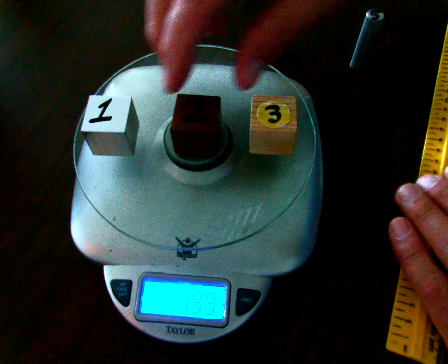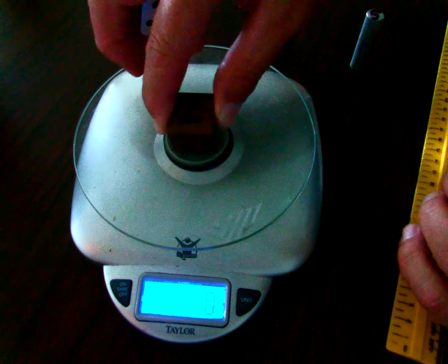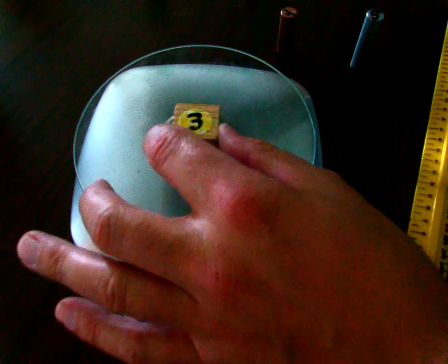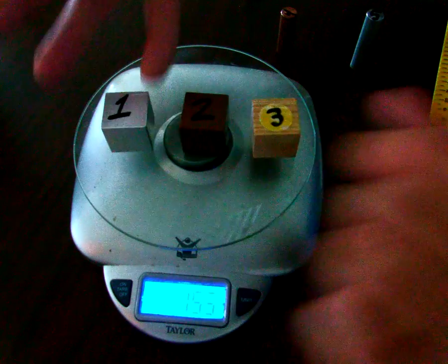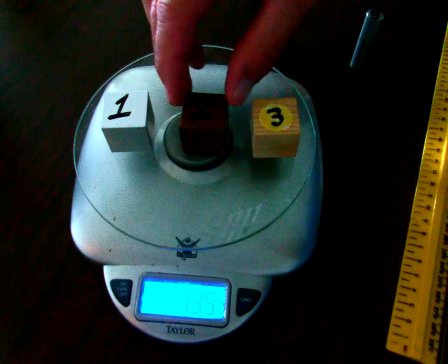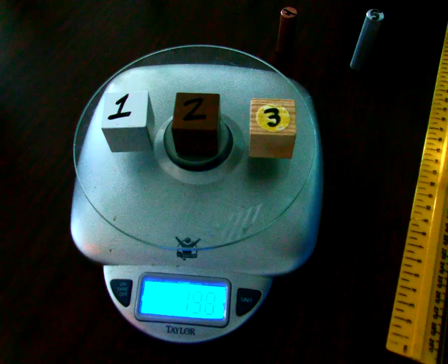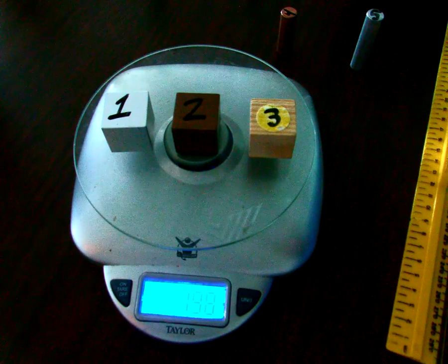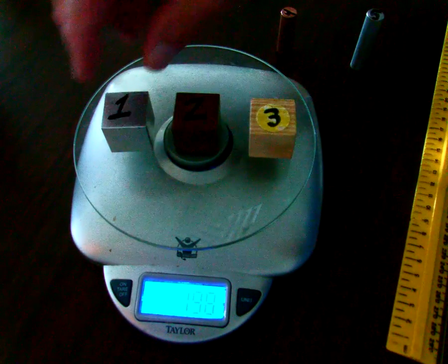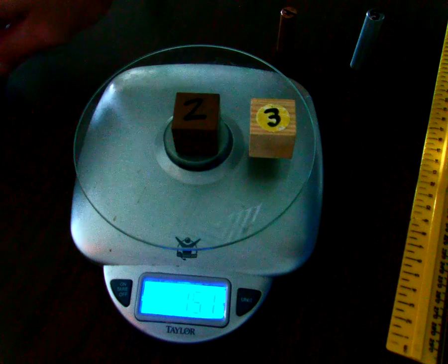Based on the fact that they have different masses, we know that they take up the same amount of space, so there's a different amount of matter in each block. The more matter that something has in a defined space, the higher its density. All 3 of these blocks together happen to weigh 198 grams.